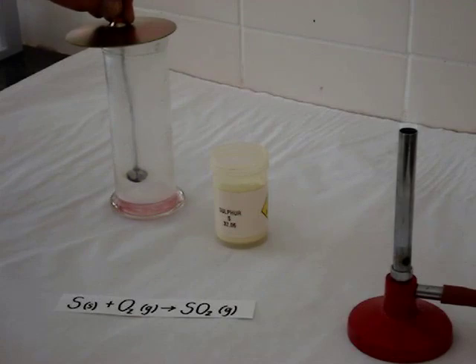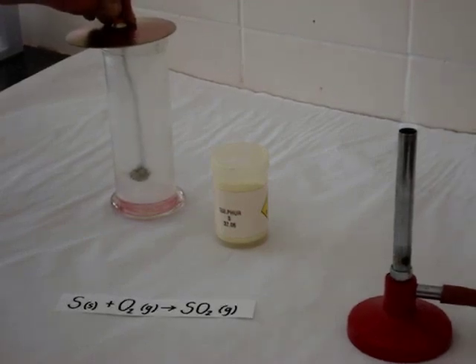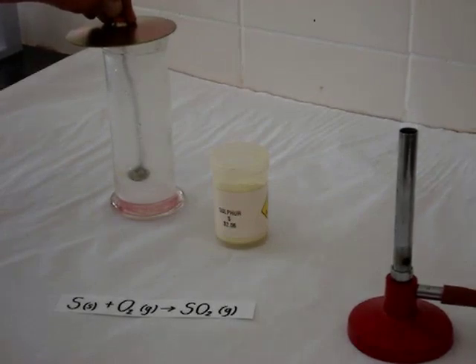At the bottom of the gas jar, we have a little bit of water, and the sulfur dioxide is dissolving and reacting with the water to produce sulfurous acid.